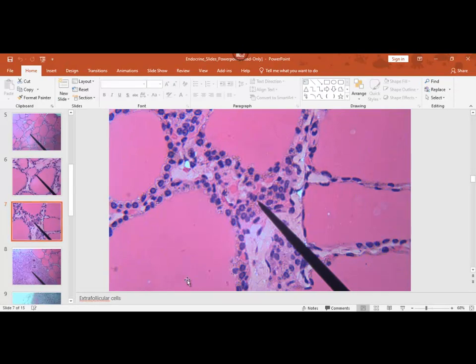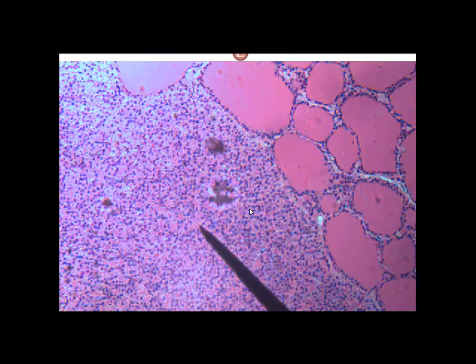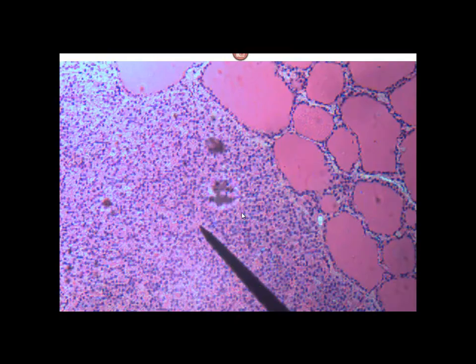Now, on these slides we use, this is a thyroid gland. The actual slide says parathyroid gland because they're so small, and this slide is really good because it's nice and colored. So here you're looking at a thyroid, you're scanning around, and then all of a sudden, boom, you would come across this big mass of cells. That's a parathyroid gland. They're very small. They're found on the back of the thyroid. Some people have 4, some people have 3.